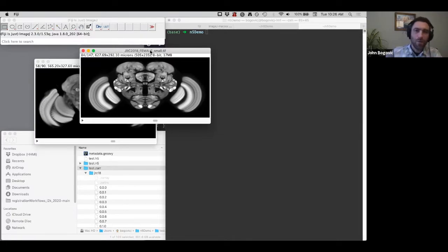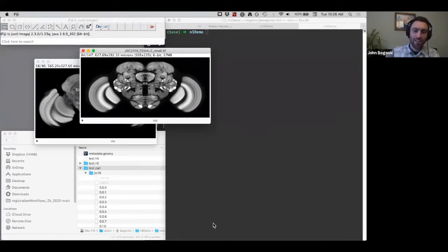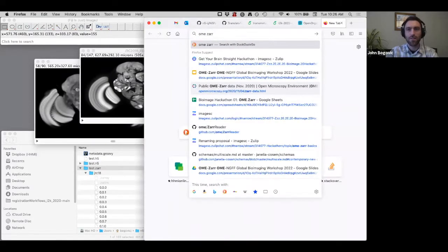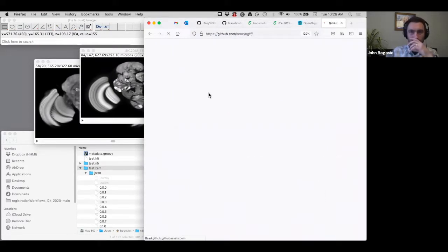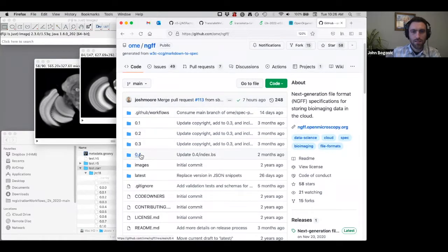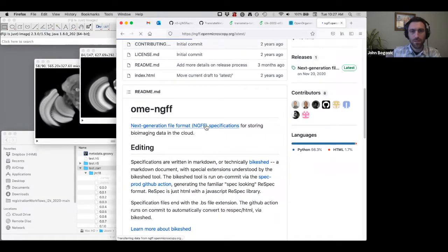I think what I would say is, if he and others here are willing to be slightly early adopters, I would recommend going with the OME Zarr or OME NGFF metadata standard. So it's here. I need to make these plugins work with the standard, but it's only a small amount of work. And I think I'll have some help, hopefully, from friends at EMBL. This standard is at 0.4, and I hope there'll be a 0.5 out. But you can look at what the specification is here.